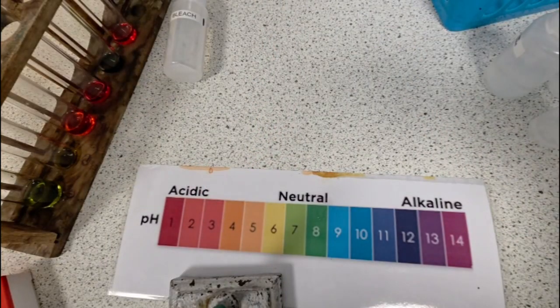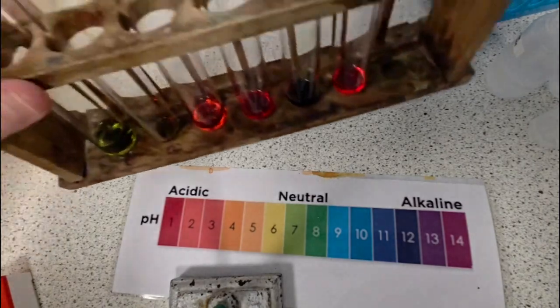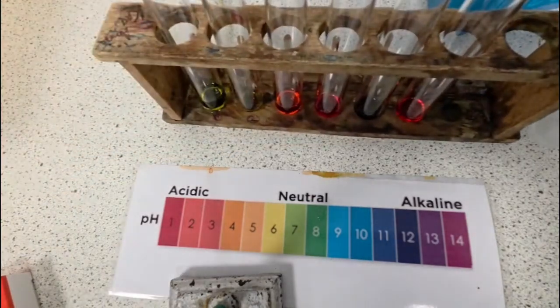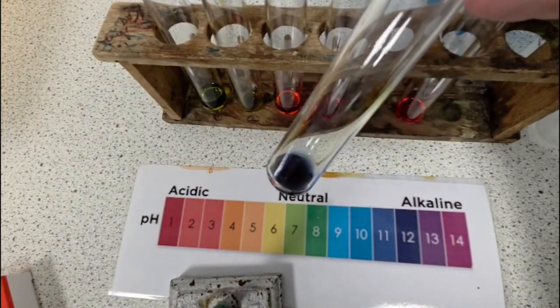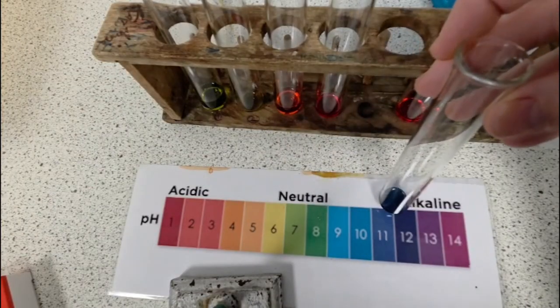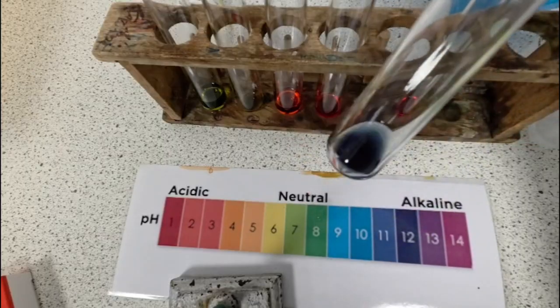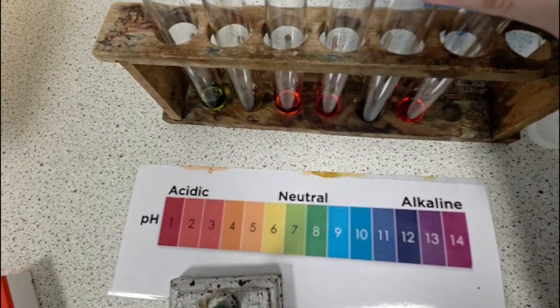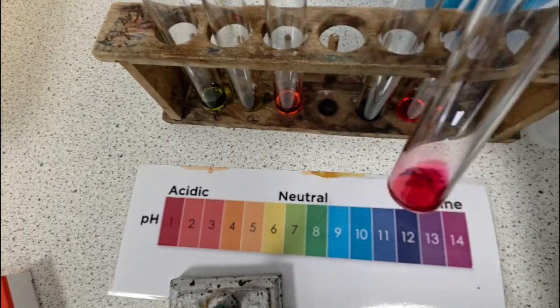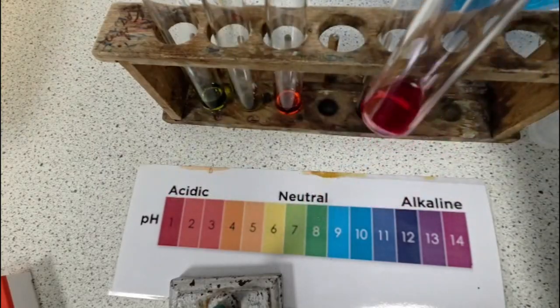Now, the beauty of universal indicator is it can warn us how dangerous a chemical is. Even without seeing the labels on our chemicals, looking at these different substances, you can see if it's dangerous or not. For instance, this chemical is that dark purple, probably a pH 12-ish according to our scale. I would not want to get that on my skin. That would probably cause some harm to my skin. Similarly, this chemical here is a very dark red, probably a pH 1. Again, I wouldn't want to get this on my skin.